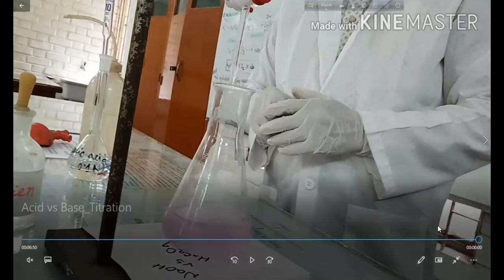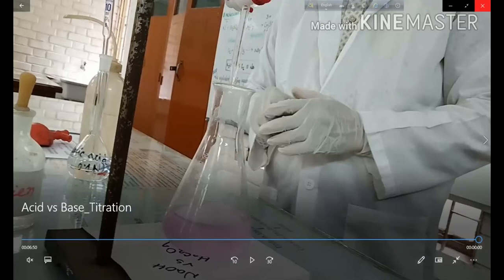This step will be repeated more than once. It can be 3 times or 4 times or 5 times, because we have to take an average volume, so that we cannot say that our experiment is not correct. So we'll take the data like this, 3 or 4 times, not less than 3 times. We'll take 3 data and we'll take the average volume of the sodium hydroxide from the 3 data.